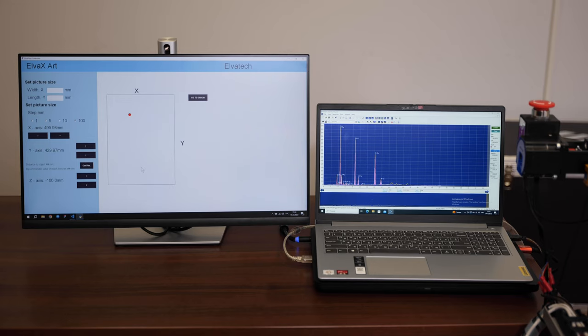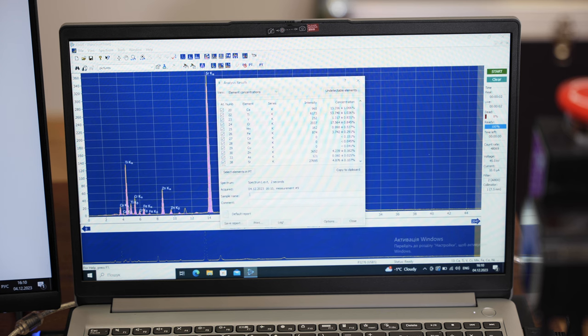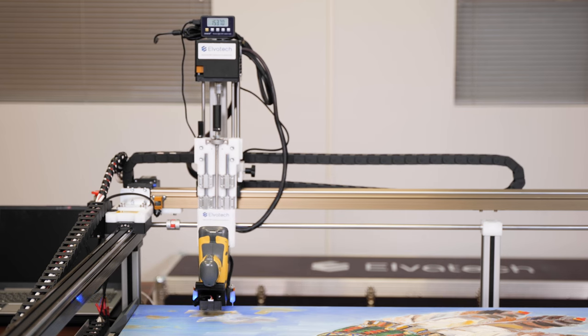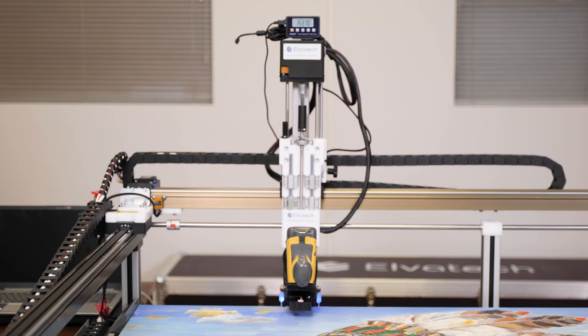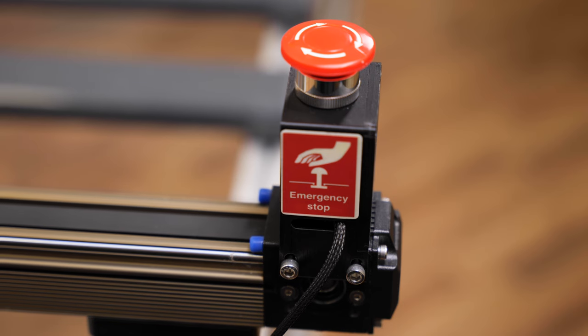The Elvox Art is controlled via computer with special software. This software not only controls the analyzer, but also controls the operation of the table's electric motors, allowing you to fine-tune the position of the analyzer for examination. This precision in setup and control makes Elvox Art an ideal tool for art historians, who can rely on this system to perform highly accurate analysis, which is especially important when working with rare and fragile works of art.